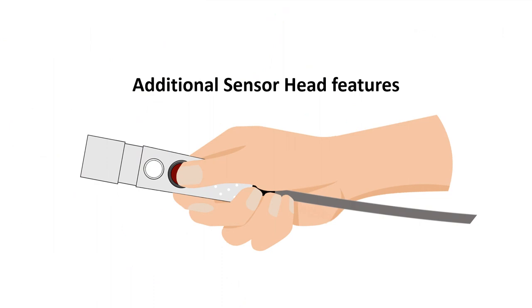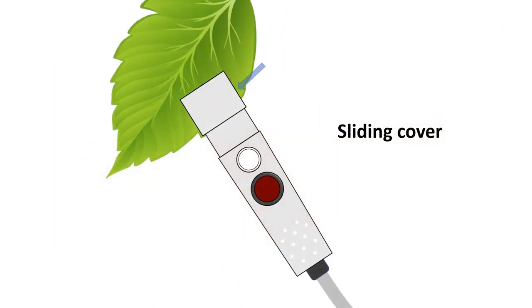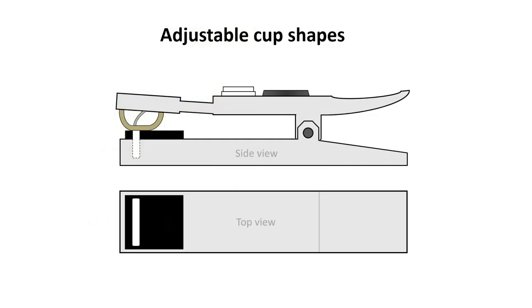The sensor head has two additional neat features which boost performance. A sliding cover on the upper part of the sensor head allows the user to see through a semi-transparent window directly onto the leaf surface and precisely target areas away from large veins.